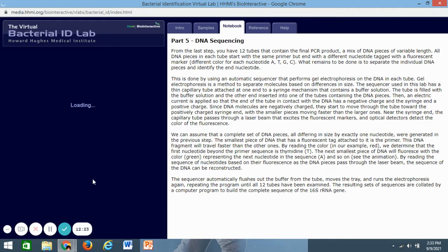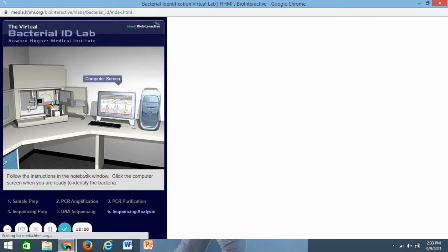We go to the last part, which is sequence analysis.